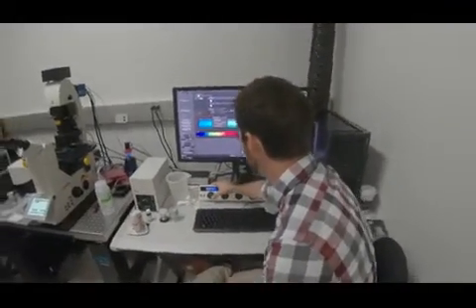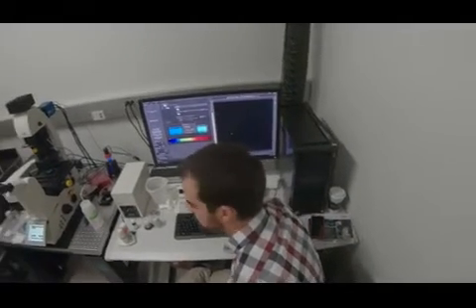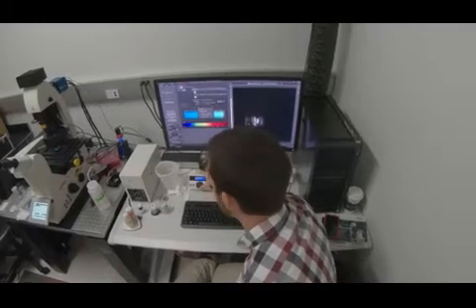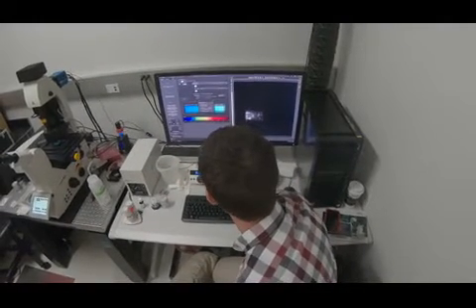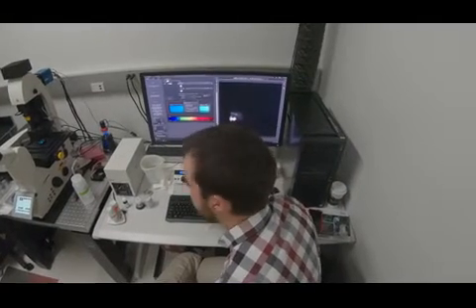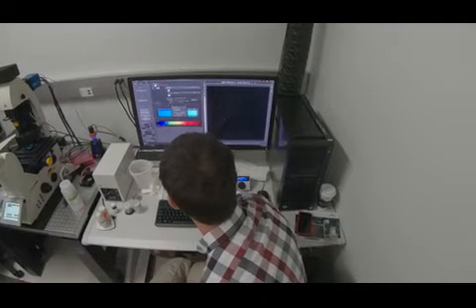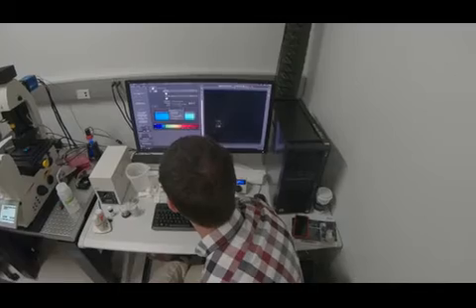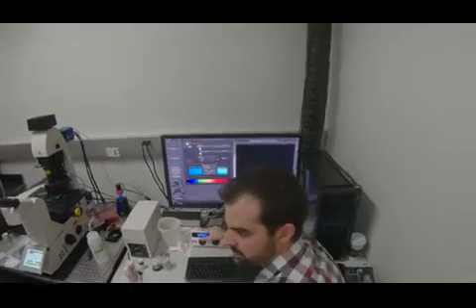So if we form that sheet of light out of the focal plane, then you'll get nothing or kind of blurry. Kind of makes sense? So we're moving the sheet of light up and down along the mirror. And so at this step, we're trying to find basically the most focused image. You'll get images along different Z positions. We want the most focused image. That's probably the most focused. There should be little beads in here. So that's good. If we are kind of off, you'll get this smearing.